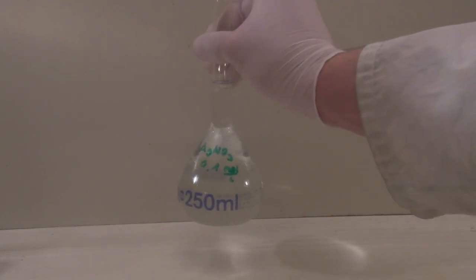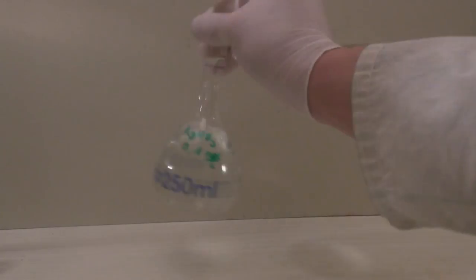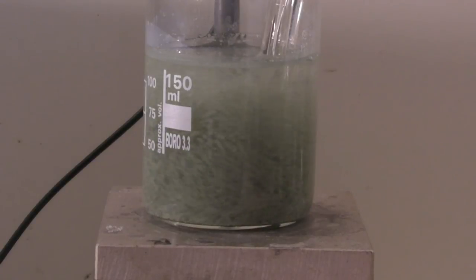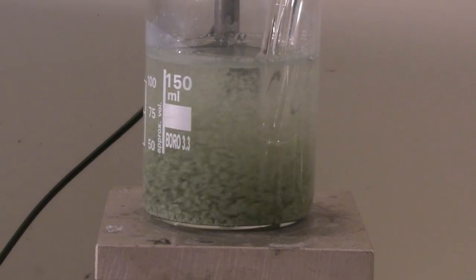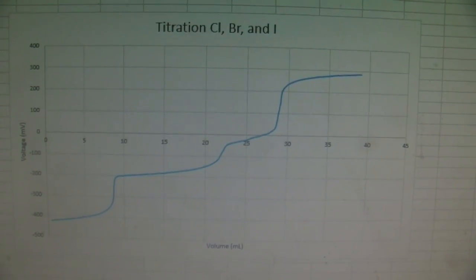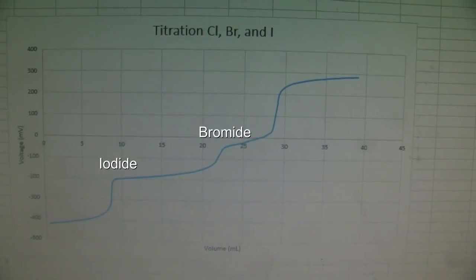This can now be used to determine the concentrations of unknown solutions of halide ions. So with the same setup, the concentrations of iodide or bromide ions could also be measured. Due to silver chloride, bromide and iodide having a different solubility product, these can sometimes be determined simultaneously. Then the titration curve contains equivalence points for iodide, bromide and chloride.